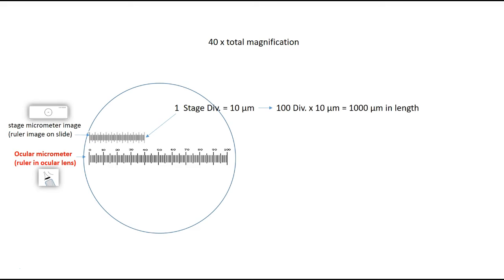Now let's put back the stage micrometer and change the 4x objective lens to the 10x objective lens and do the calculations all over again. By doing this, you should notice that the stage micrometer's image is a lot bigger than before, but equally important is that the ocular micrometer's image stayed the same. Again I want to align the two micrometers. Remember: one division of the stage micrometer is 10 micrometers and the total length is 1,000 micrometers. Please pause the video now and see if you can calculate how many micrometers one ocular division equals.